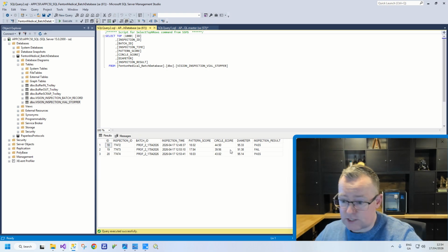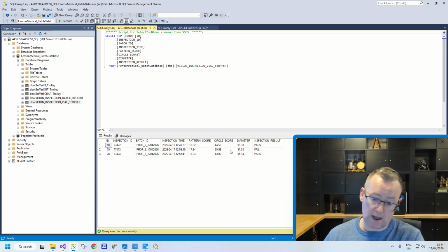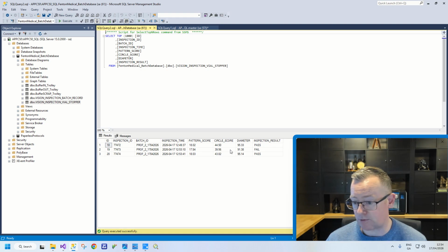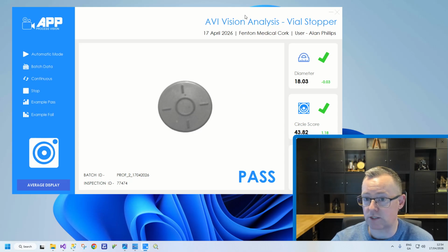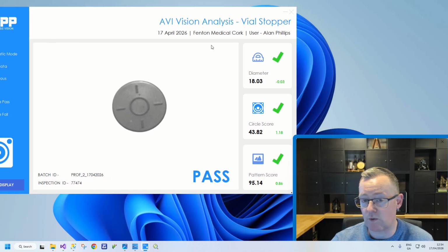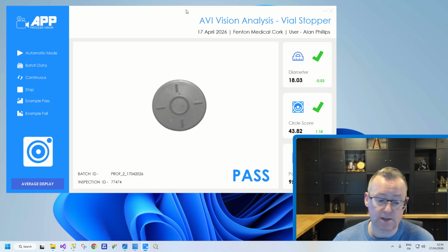So in real time, that's the benefit of having a vision system there. You can have this full high-speed production, and the cameras are acquiring all the time, and then you can set up this SQL database for an analyst to come along at a further time to take a look. And as well, you've got real-time analysis, saying whether a product is good or not. So therefore it can be ejected by a machine for scrap, momentarily later, or whichever else.